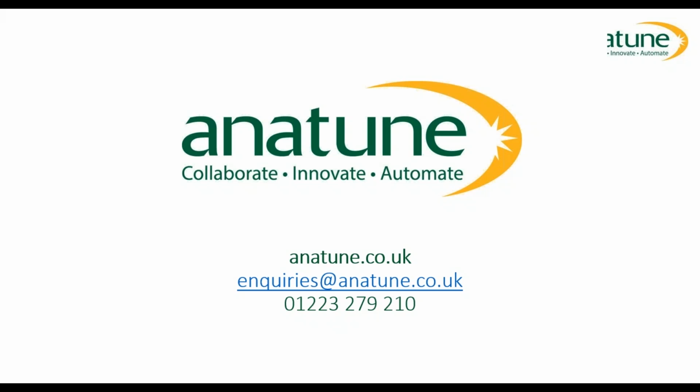I think what we want to get from this webinar is that underlying everything is the same set of things you want to do for a validation exercise. Validate your instrumentation as much as your method, and it's easy to do. Linearity, precision, LODs, intermediate precision. It's really straightforward.